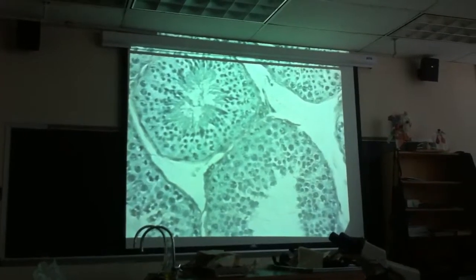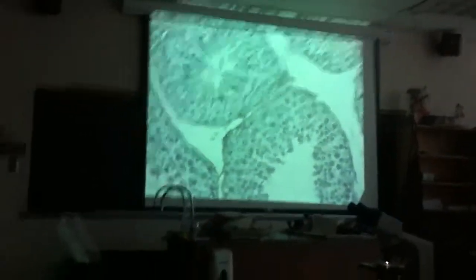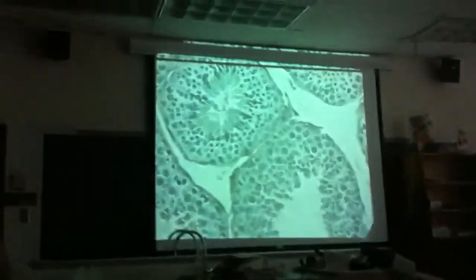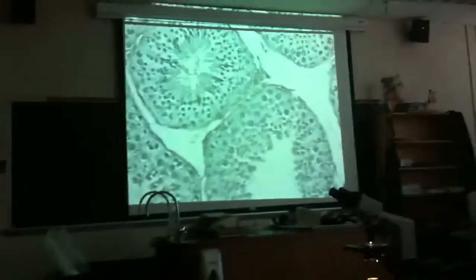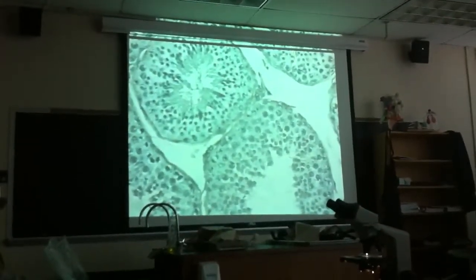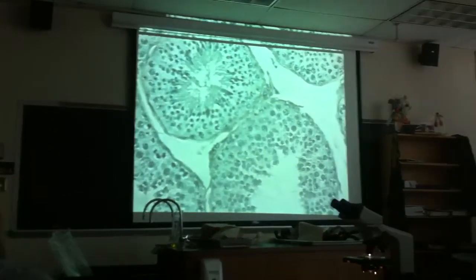I'm less likely to ask you seminiferous tubule on this one because we're learning these two new parts that make it up. I'm more likely to ask you spermatids or spermatogonia than seminiferous tubules. Interstitial cells are still up for grabs though. I could probably label those too.